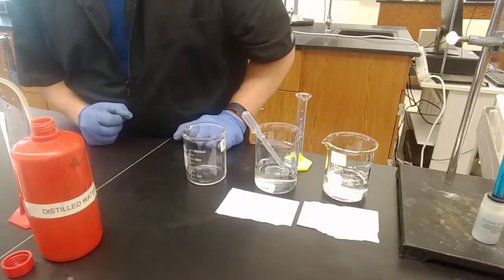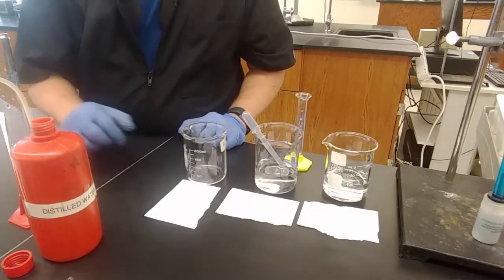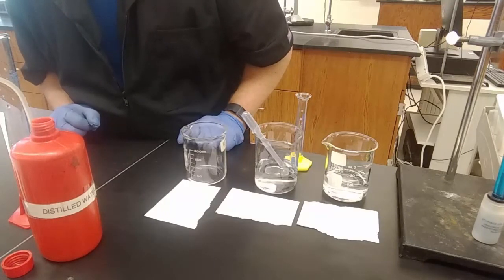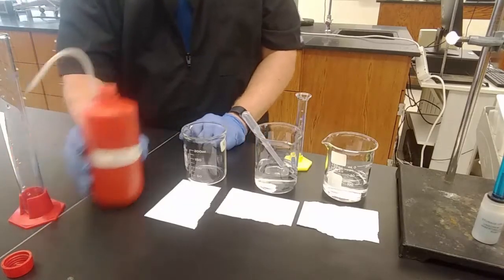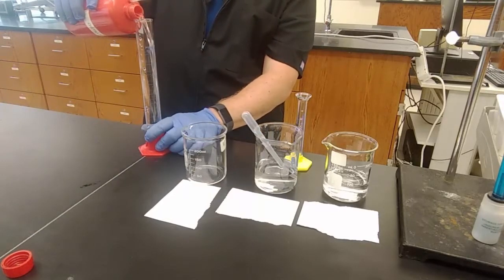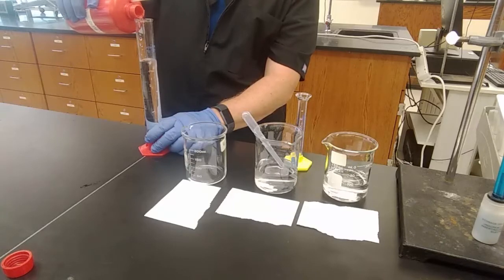All right. So I have that third 250 milliliter beaker. I'm going to label this one 3. And I'm going to take 1 milliliter of the solution in beaker 1 and 99 milliliters of deionized water. So the way I'm going to do that is 99 milliliters of water.